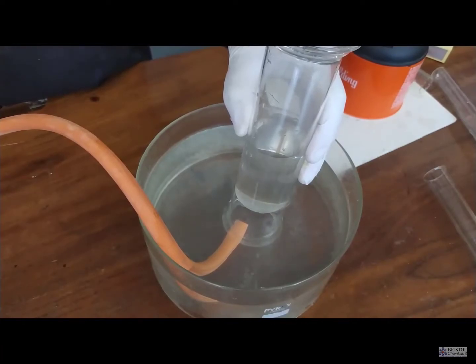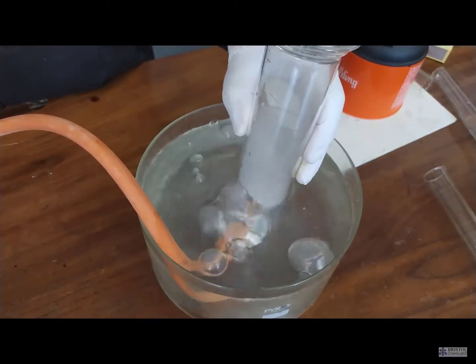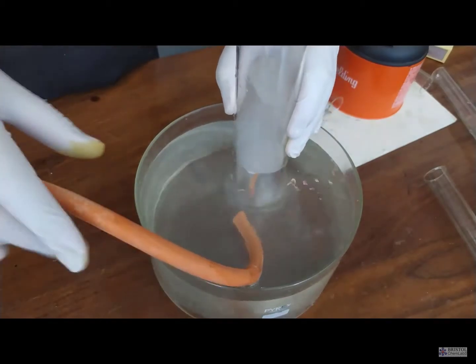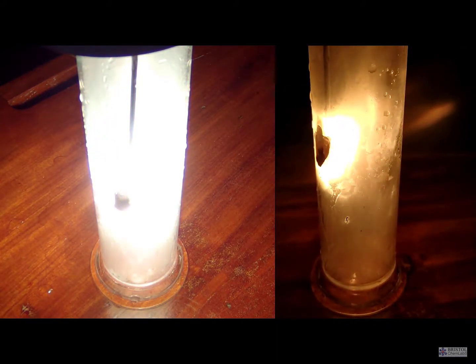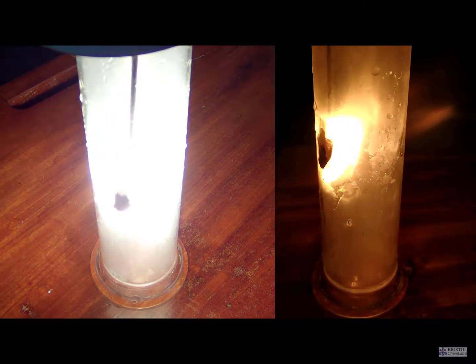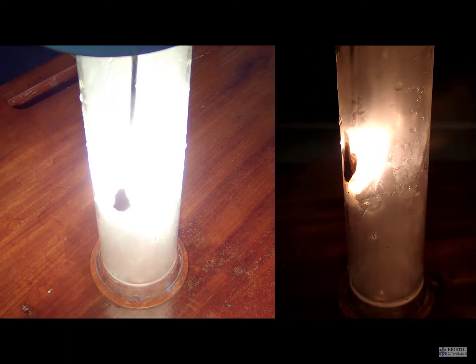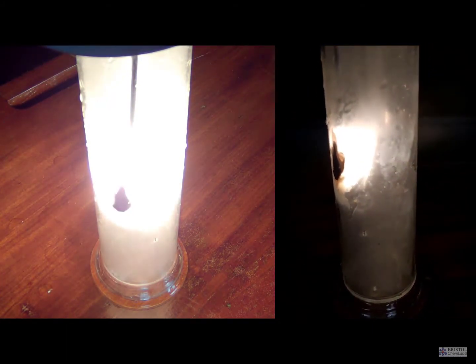Once you have your gas jar of oxygen filled, typically with a gas jar lid, although we didn't have one to hand here and had to make do with a large watch glass, that gas jar lid can be greased to make it more airtight, particularly for longer term storage of oxygen by the technical staff prior to the teacher demonstration.